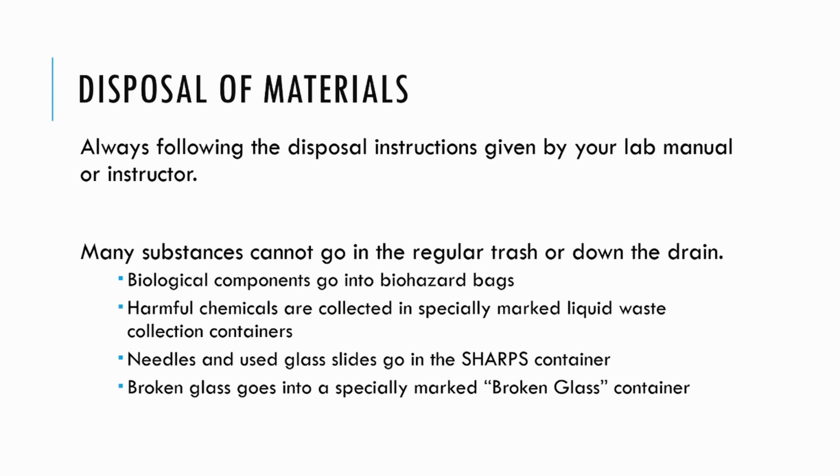But there's a lot of things we use in the lab that cannot go in the trash or in the drain. Biological components, such as things from dissection. If you are cutting up a liver or a fetal pig, you can't throw those biological components in the regular garbage. Instead, they'll go into a biohazard bag that will be specially dealt with before being handed off.